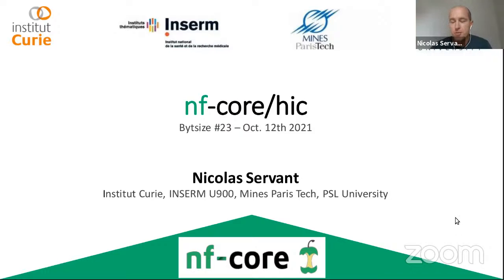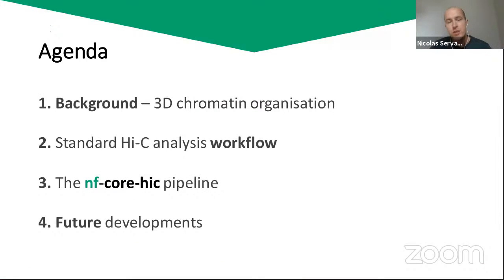It's a pleasure to be here today to discuss the nf-core HiC pipeline. For today, I'm going to first introduce the project and the context about chromatin organization. Then I will describe the main steps of a typical HiC data analysis. Moving to the nf-core HiC pipeline, I will show you how to use it and how to look at the results. And finally, we will discuss the future developments of this pipeline.